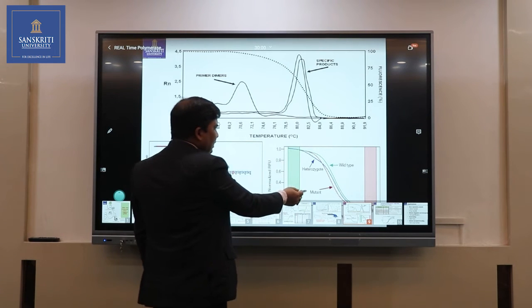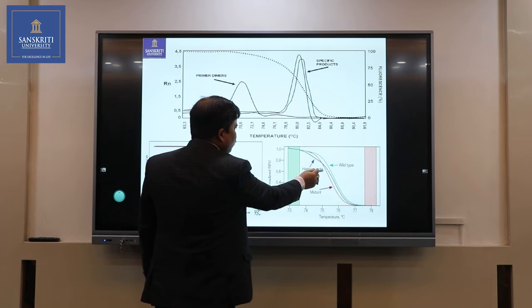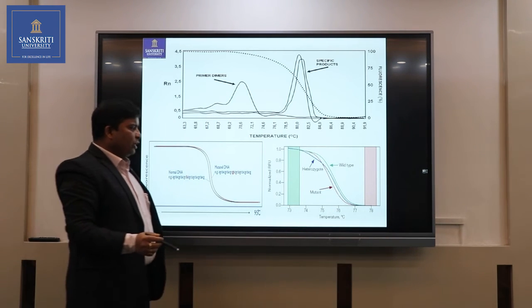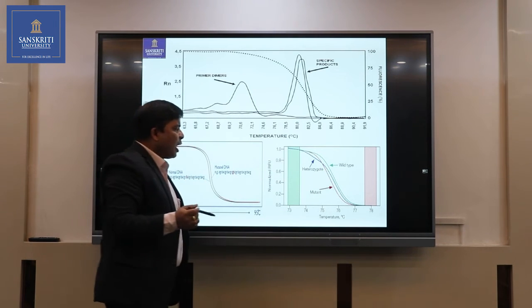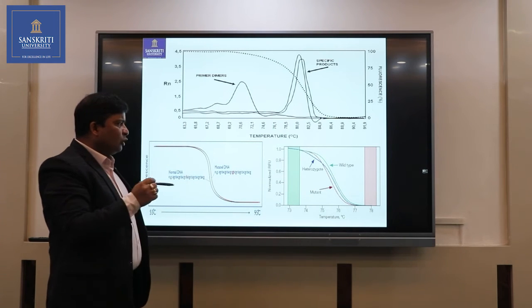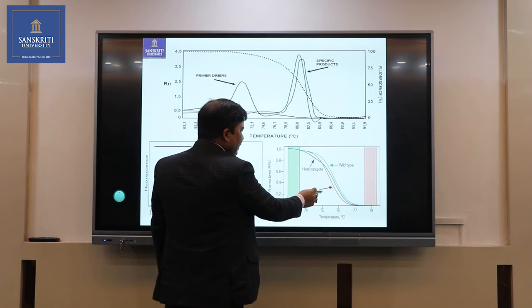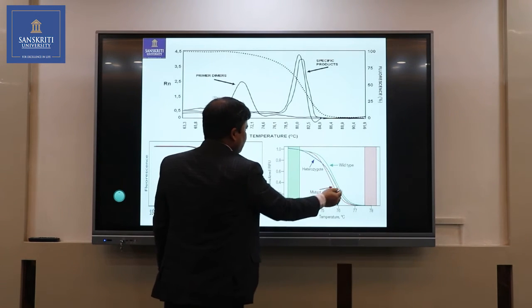Here we can see that we are analyzing the mutant, heterozygote and wild type of the template for the real time PCR. Because wild type has high GC content and mutant type has lesser GC content, that's why we are getting the melt curve earlier in mutant and later in wild type.